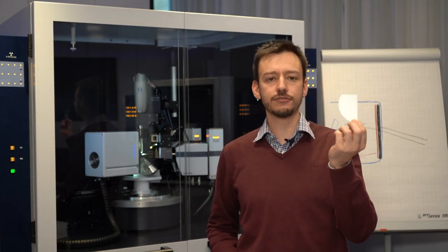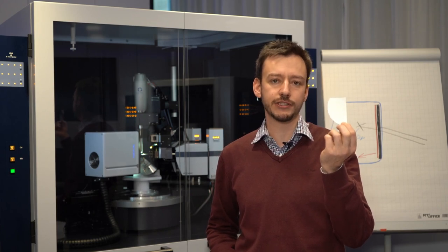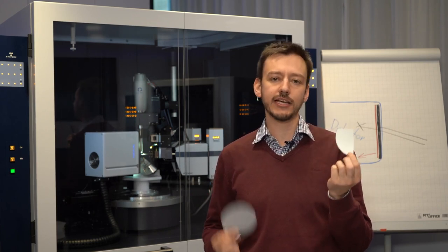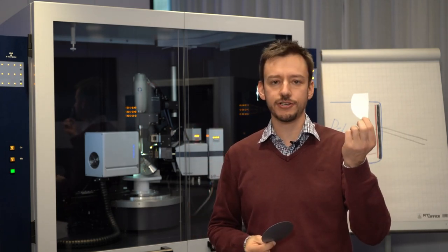In my left hand I have an X-ray conversion material. The Photon 3 is the only photon counting detector that uses such an X-ray conversion material and we will now do an X-ray experiment comparing the absorption capabilities of the silicon wafer and this X-ray conversion material.